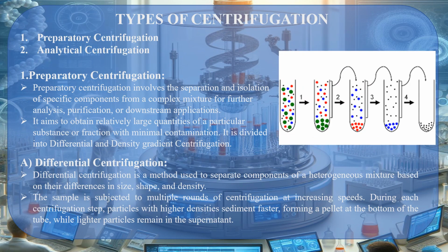So next is types of centrifugation. There are two types: preparatory and analytical. Preparatory involves the separation and isolation of specific components from complex mixtures for further analysis, purification, and downstream applications. It is divided into differential and density gradient.